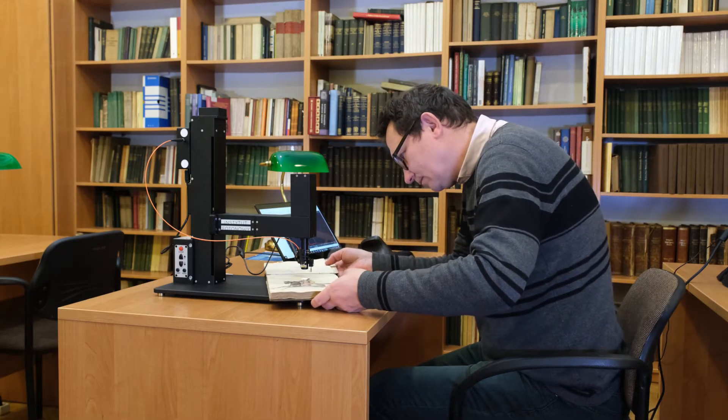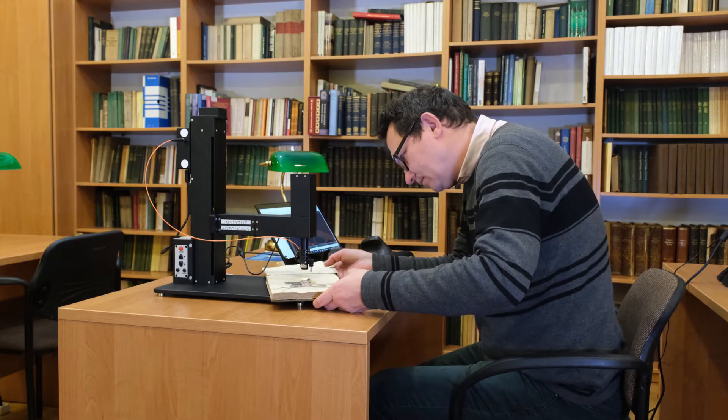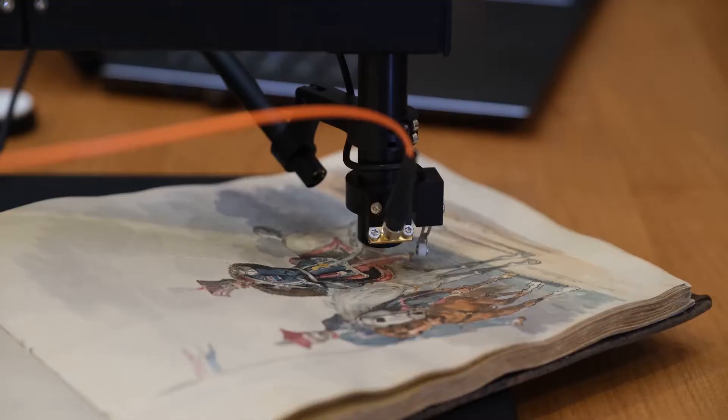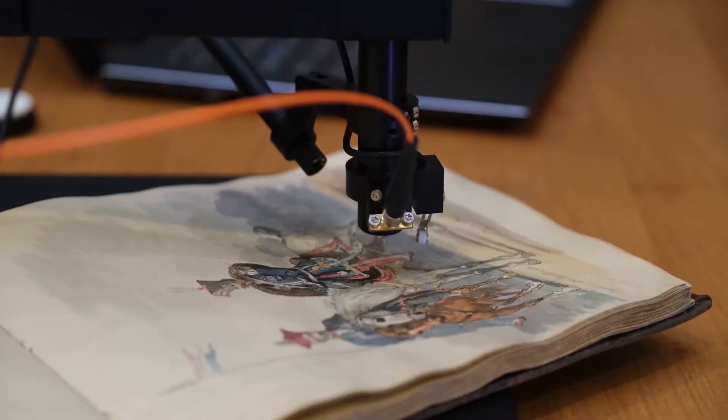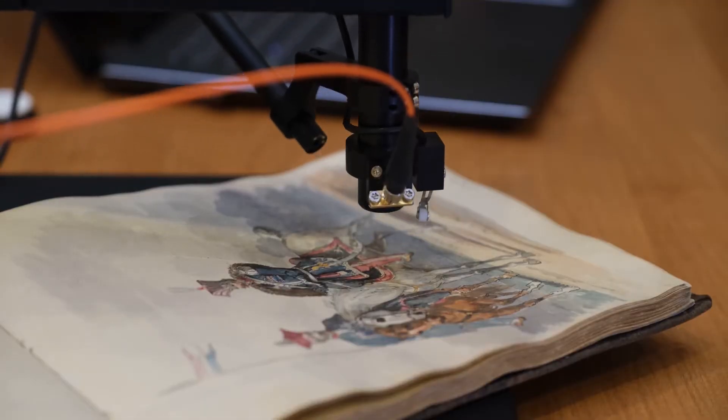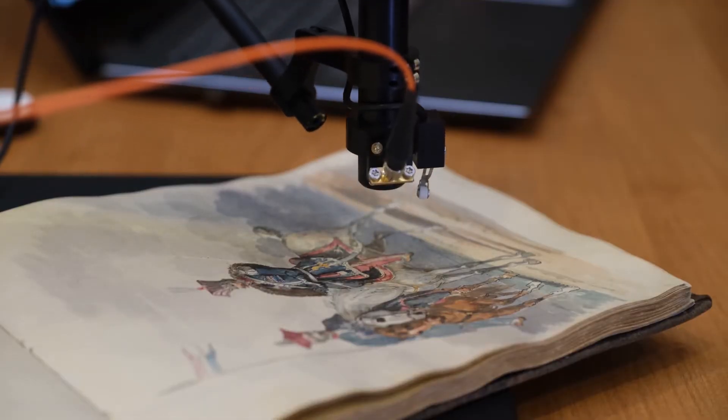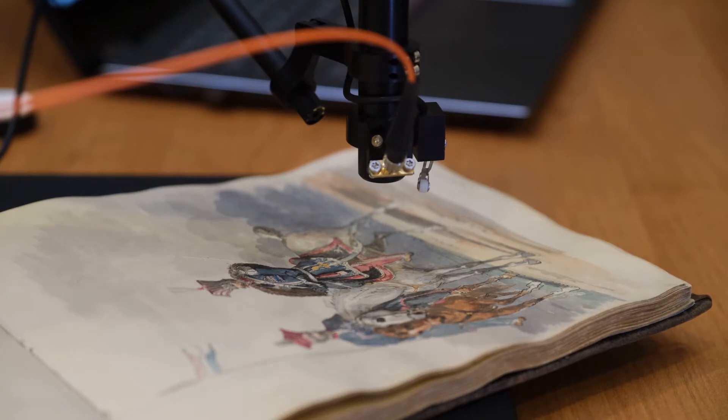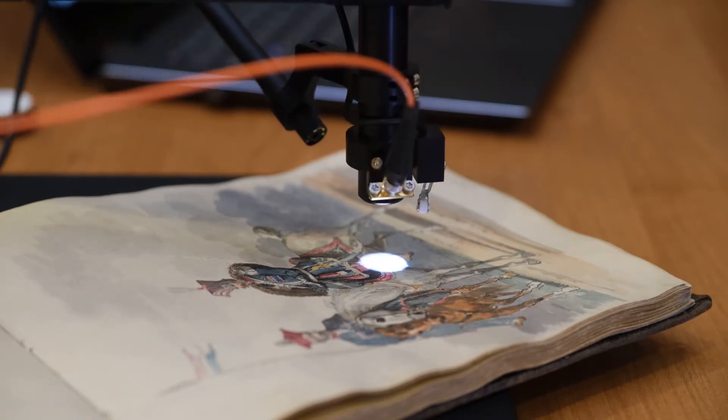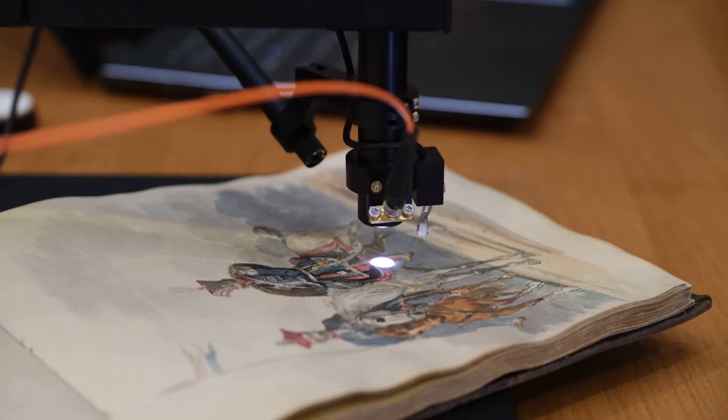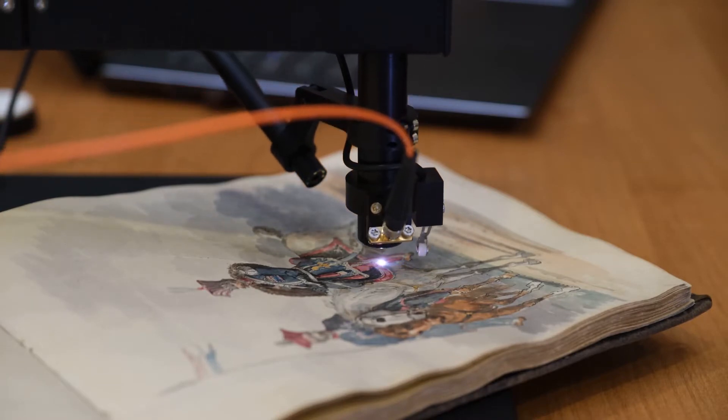The device consists of a very stable light source with spectral characteristics identical to modern gallery illumination, for object illumination with a spot of half a millimeter in diameter.